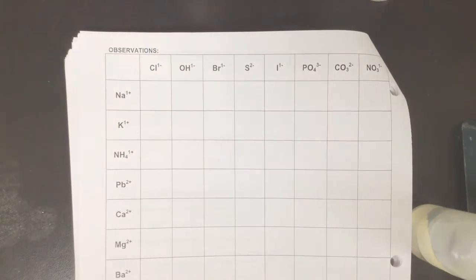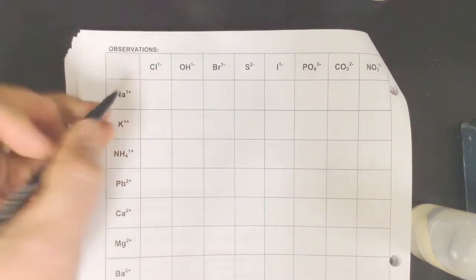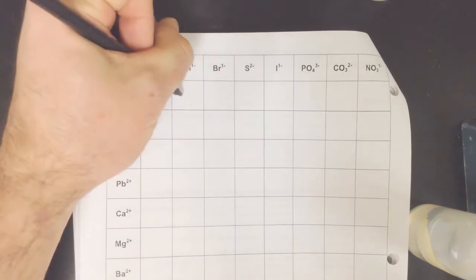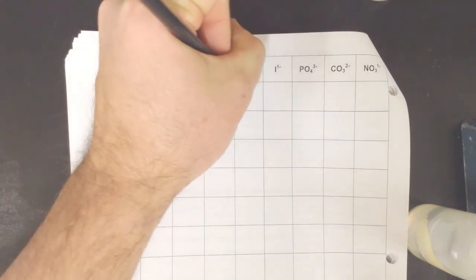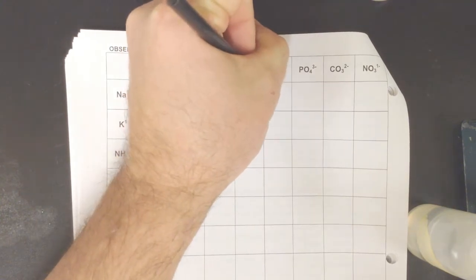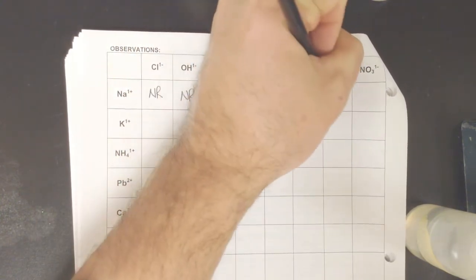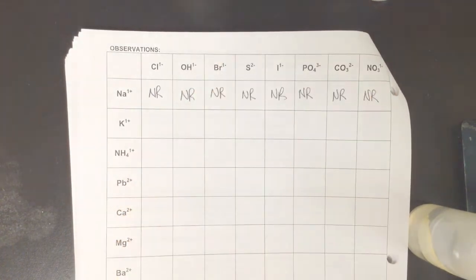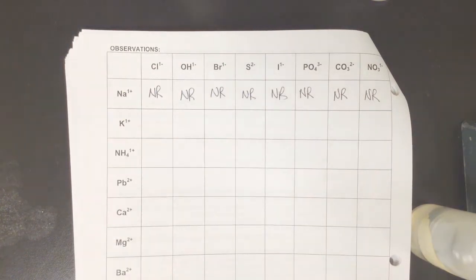So here's our observation table, and we had no reactions for all of these ions. When we combined sodium with chloride, we had no reaction. NR is what I'm going to write down. We had no reaction with the hydroxide, bromide, sulfide, iodide, phosphate, carbonate, or nitrate. NR all across the board. Okay, let's move on to potassium.